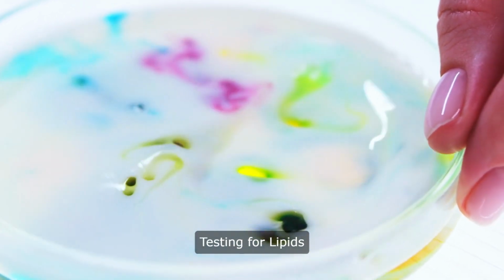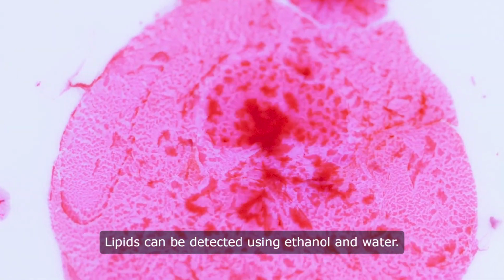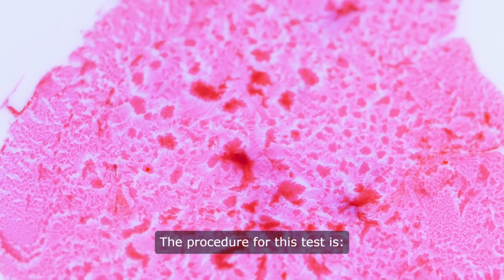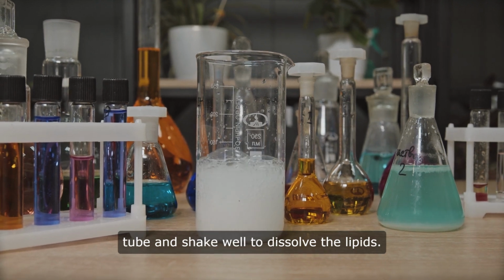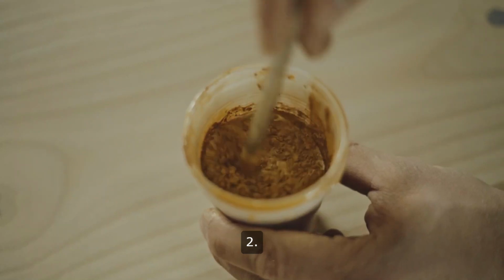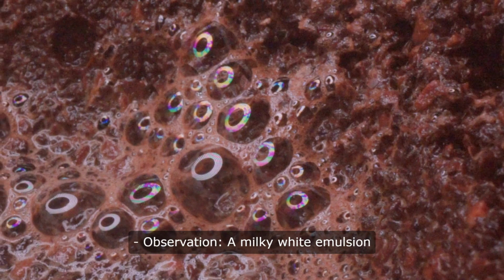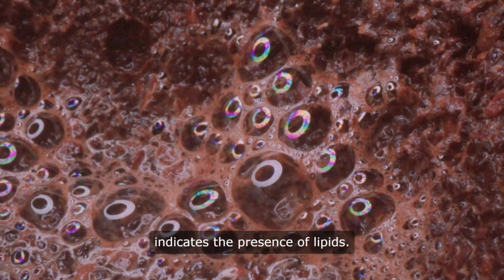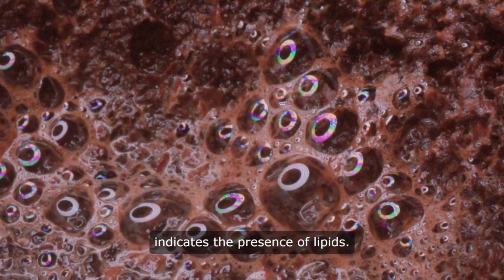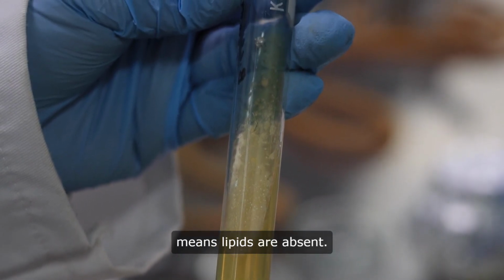Testing for lipids, emulsion test. Lipids can be detected using ethanol and water. The procedure for this test is: 1. Mix the food sample with ethanol in a test tube and shake well to dissolve the lipids. 2. Add water to the mixture and shake gently. Observation. A milky white emulsion indicates the presence of lipids. The formation of a clear layer means lipids are absent.